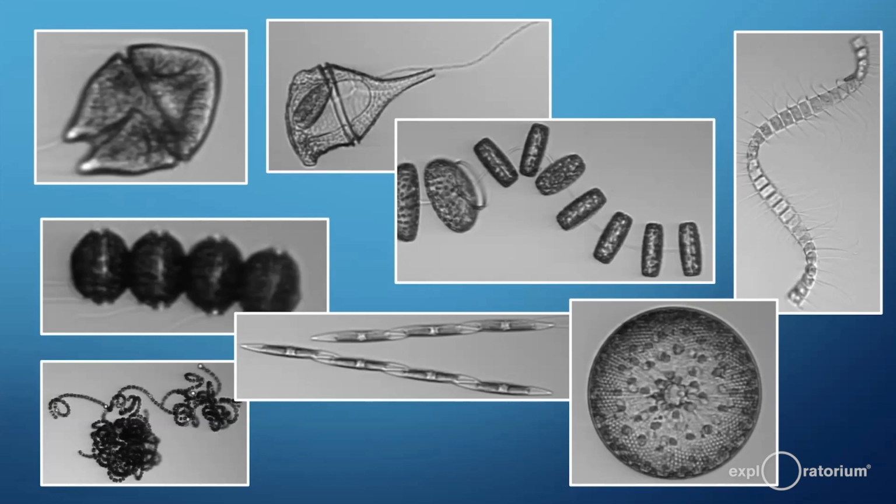This is brand new technology. They've been around for a few years. Our lab actually has 3 of them, Miranda, Tina, and Vanessa. Tina's in Santa Cruz and Vanessa is in New Zealand, also looking at phytoplankton. So with all 3 together, the volume of photographs of phytoplankton that come into our lab is far beyond what human eyes can look at.